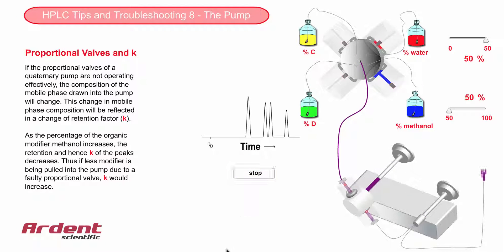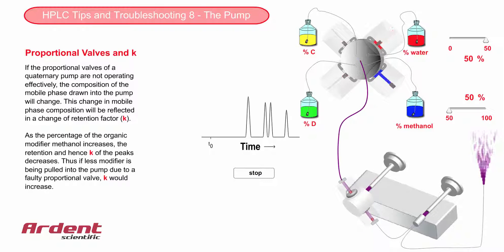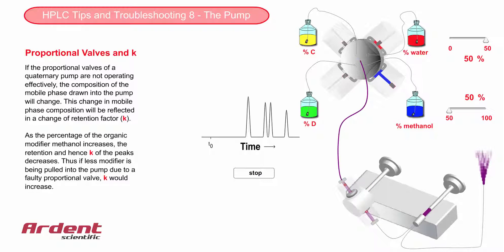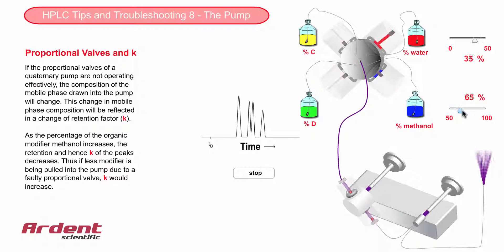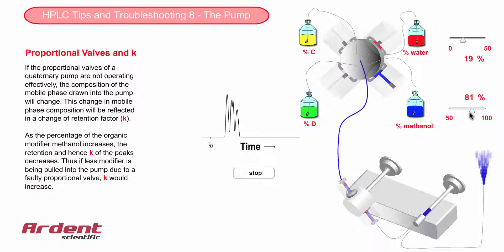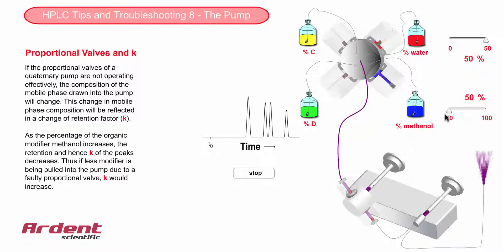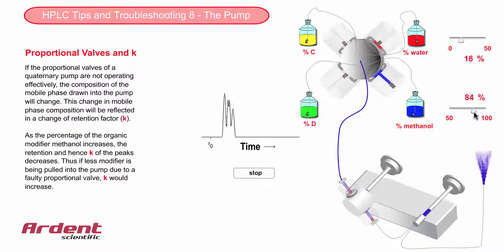An understanding of some of the basic principles in HPLC can help you diagnose where the problem is occurring. For example, a change in retention factor is symptomatic of a selectivity change, which can be caused by faulty proportional valves. A measure of the retention factor can even indicate which valve is faulty, although on many modern systems all proportioning valves are changed as one part.